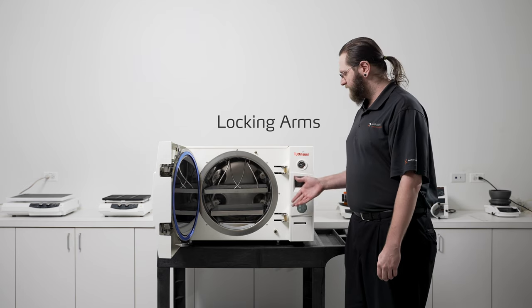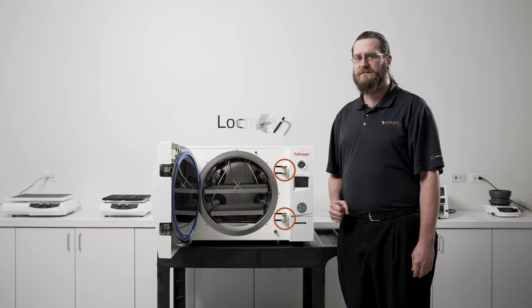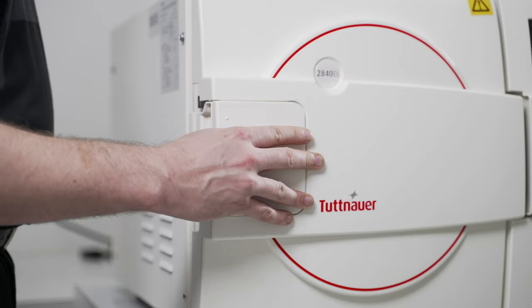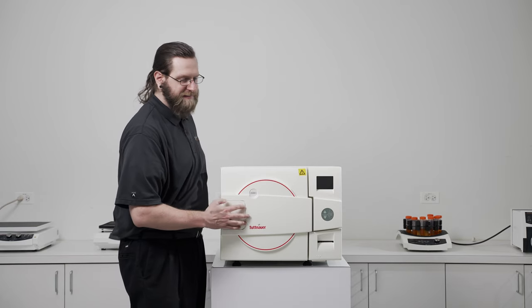Next I'd like to point out the locking arms located to the right of the chamber. These ensure that the unit stays secured tight during operation. Depending on your model of autoclave the locking mechanism may vary. On our smaller units the door opens on the left side via the integrated unlocking handle. To secure the door you need only close it and press firmly until it snaps back into place.